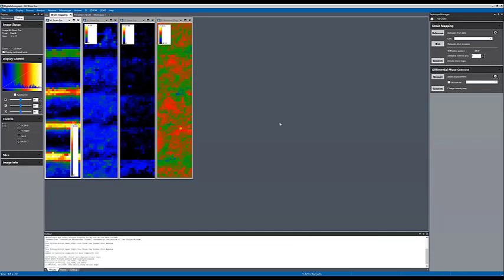I'm sure Roberto can comment. There are simulations for this as well. Yeah, I can put the reference on that, and also, in the same note, the dose, right? There's a limitation of the signal to noise that you need to calculate the strain. Yes.